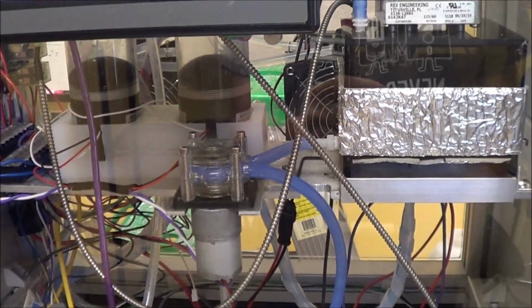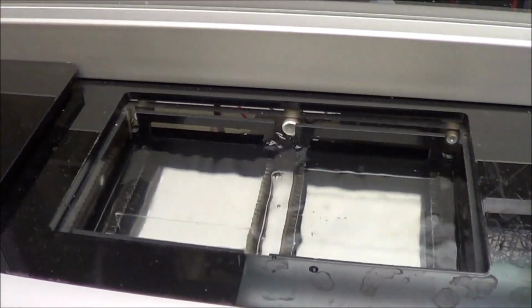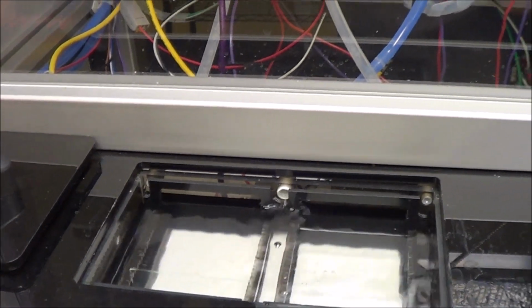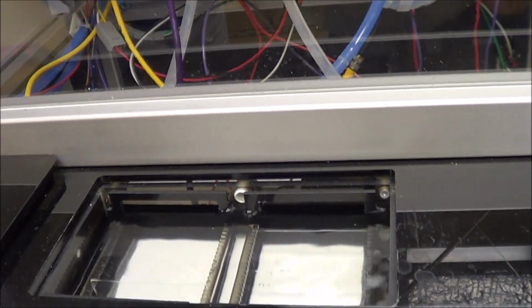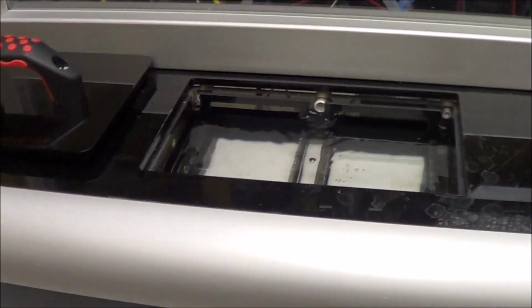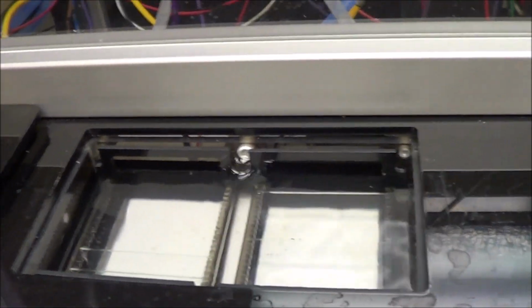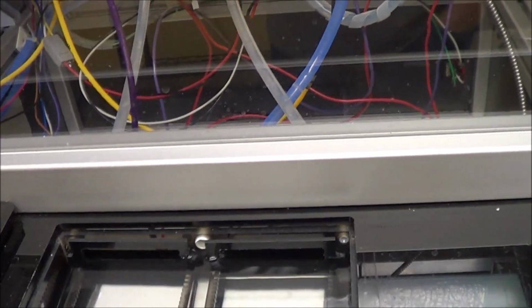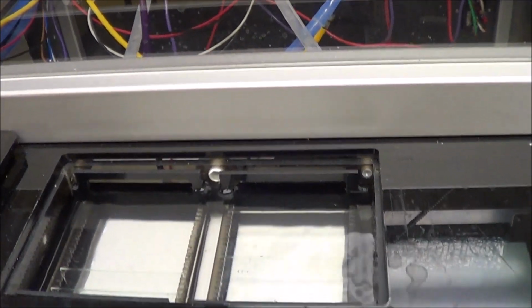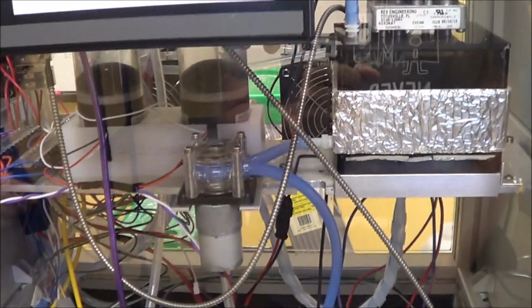So we're waiting for the pump timer to time out. You can see we've transferred the fluid. It's essentially empty. It probably is going to go on for 30 seconds longer than it needs to. Yeah, exactly, but in the overall scheme of things, it's not going to make much difference. No, over a 23-hour process, it's nothing. So when that pump stops, that's when the unwinding process begins.